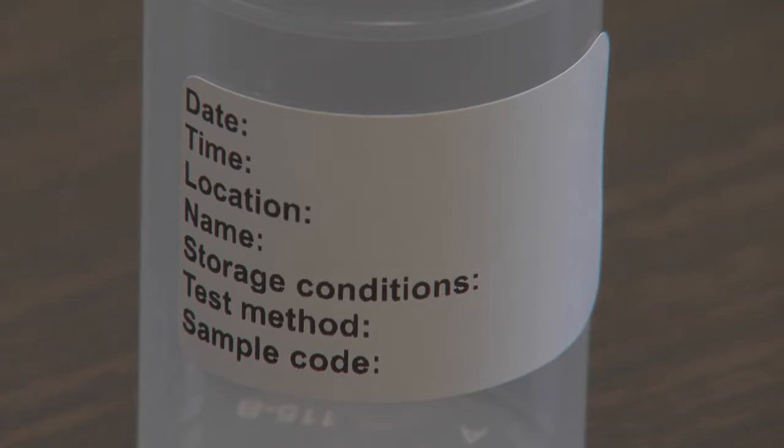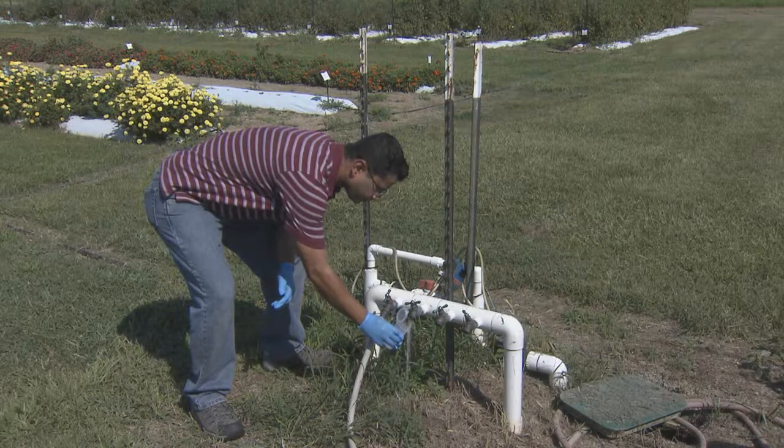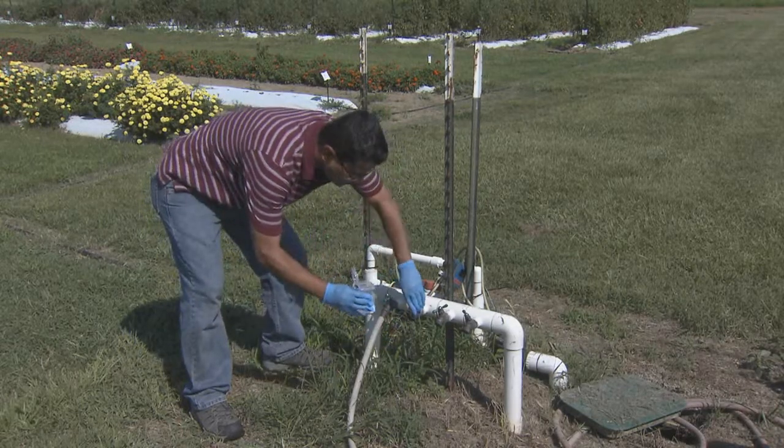Mark the vessel with the following information: date, time, location, name of the person collecting the sample, storage conditions of the sample, test method, and sample code. This should correspond to a specific location from where you collected the sample.